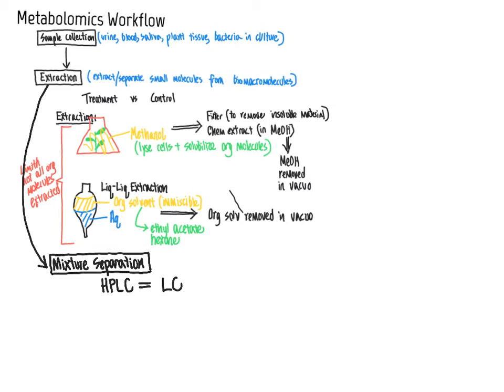This is the same exact technique that we talked about last week when we were referring to LC-MS, where we pass the compound mixture through a chromatography column that separates the compounds based on some physical property such as polarity, so that when the compounds exit the column, they're exiting the column at different time points based on their polarity or some other physical property, and then entering the mass spectrometer or NMR for data acquisition.